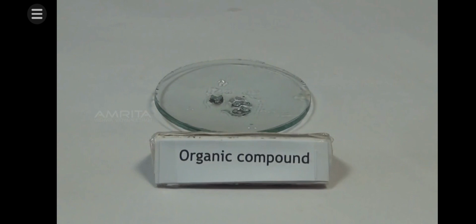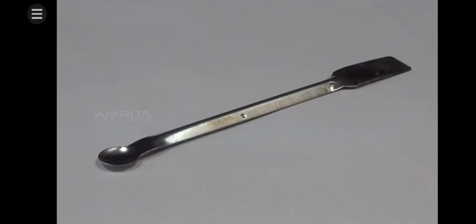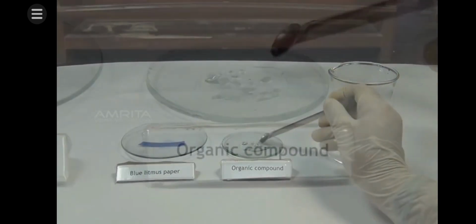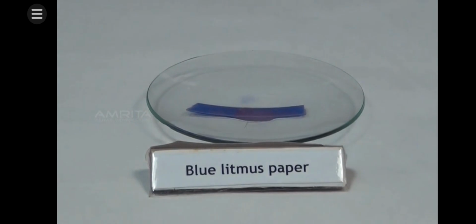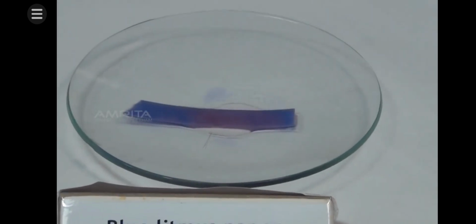Litmus Test. Materials required: organic compound, moist blue litmus paper and spatula. Procedure: take a small quantity of organic compound using a spatula. Place it on the moist blue litmus paper taken in a watch glass. Phenol is a weak acid. It turns the color of blue litmus paper red.